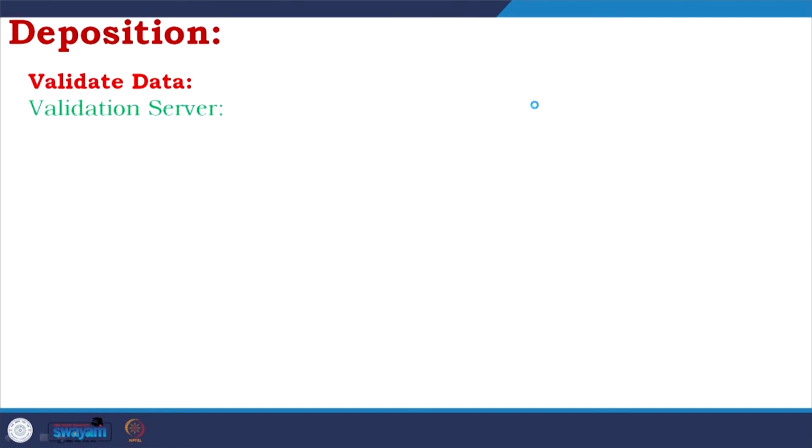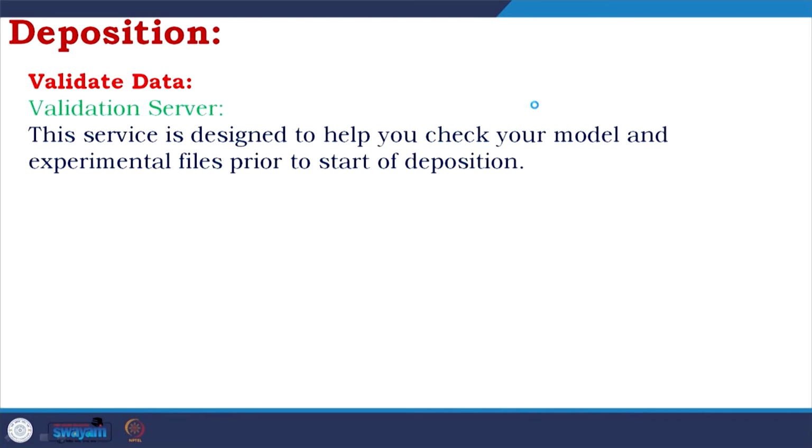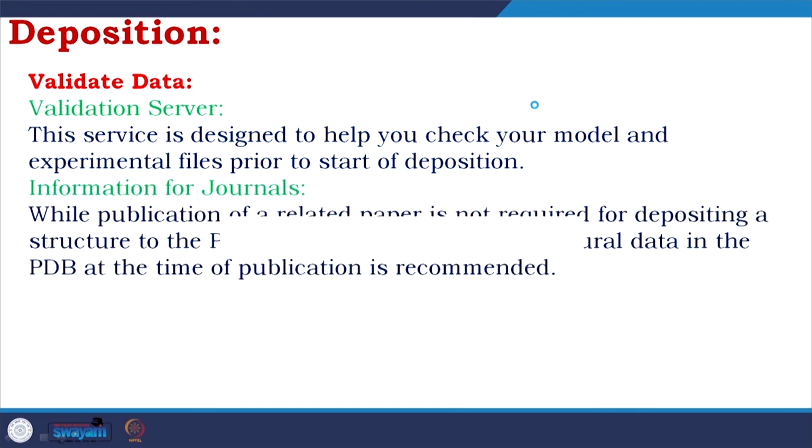You also have to do validation. There are validation servers. This service is designed to help you check your model and experimental files prior to the start of deposition. Information for journals.